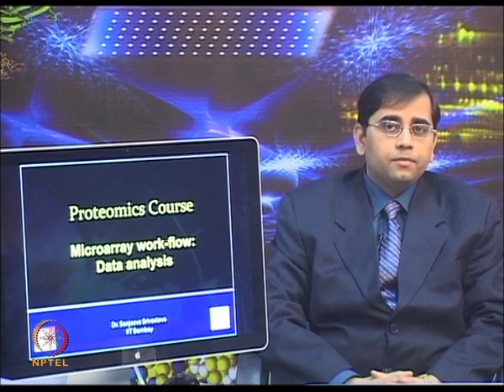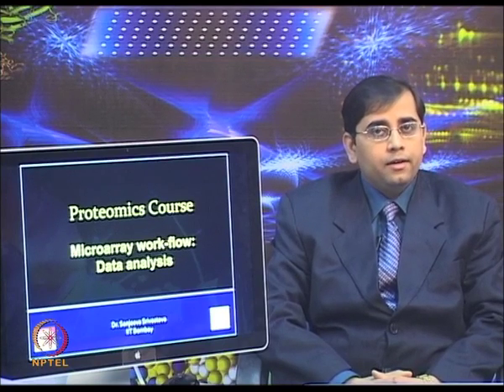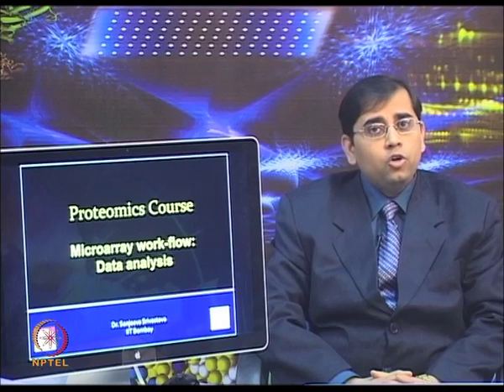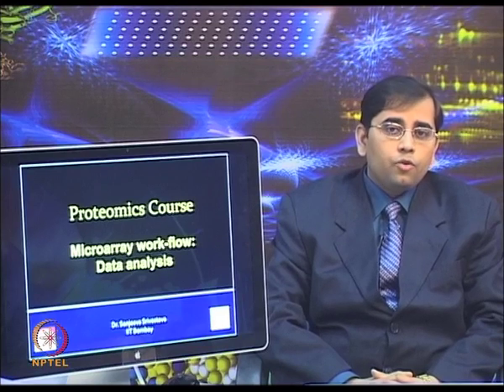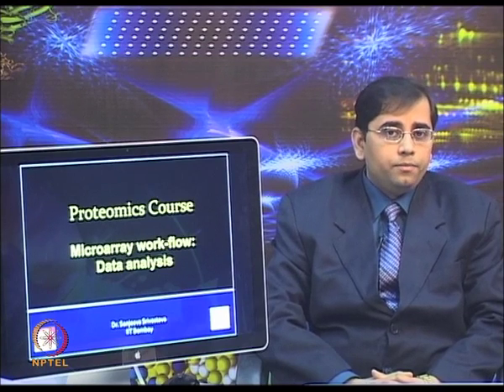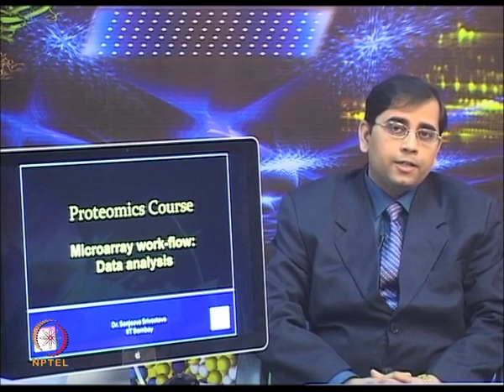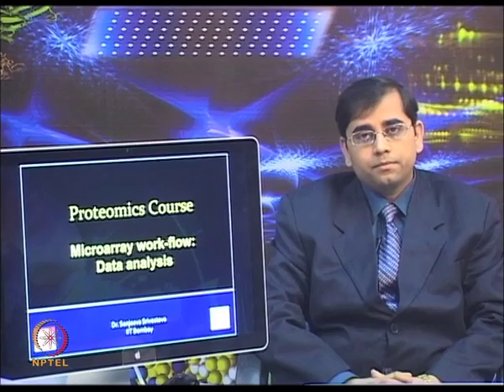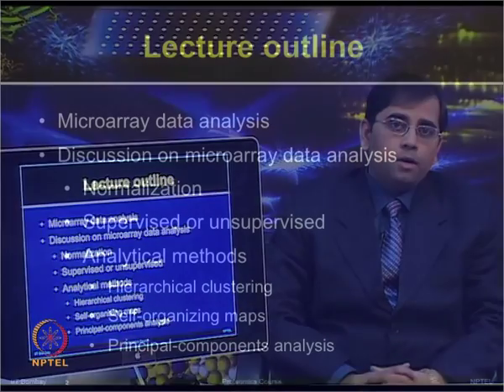Data analysis becomes very crucial to make sense of the massive amount of data generated by microarray based experiments. There are many commercial as well as free software packages available which can be used to analyze microarray data sets. However, any single software package may not answer all the questions related to fundamental genomic or proteomics based questions. So, in today's lecture, we will talk about microarray data analysis.